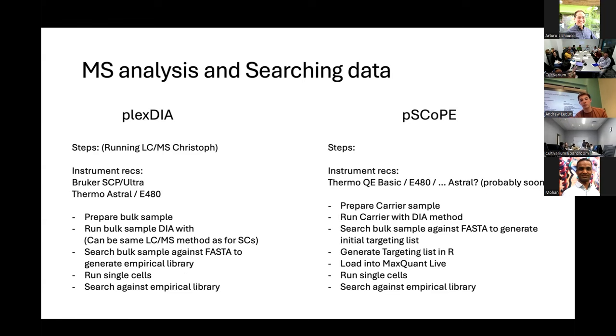that you might want to tell it specifically to go after. Instead of this algorithm where you just take the most abundant thing, we want to tell it specifically what we're confident in, what we're biologically interested in. So first we generate the DIA run, we see everything that we possibly could decide to go after, and we get the retention times.